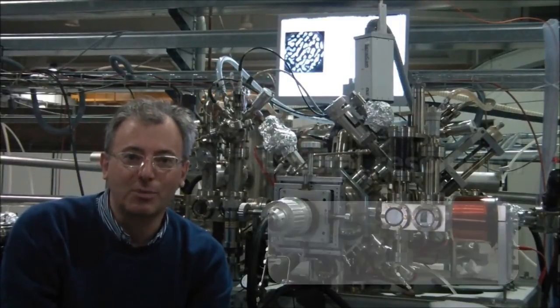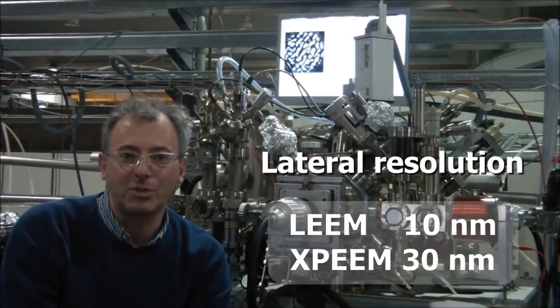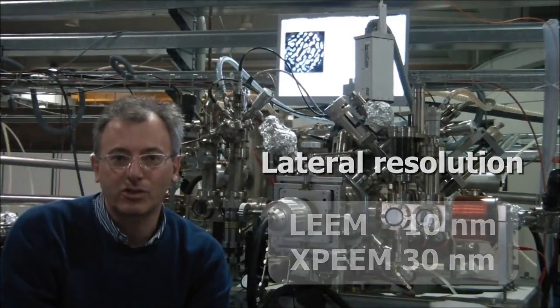Ten years after opening the beamline to external users, nanospectroscopy is still at the front line. We strive to keep the pace on the instrumental side, maintaining the instrument at the state of the art. Our microscope reaches 10 nanometers in LEEM and 30 nanometers lateral resolution in XP.